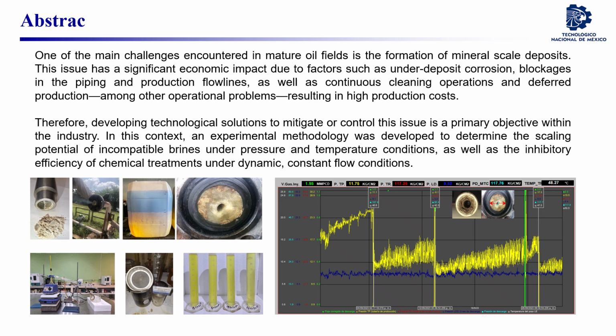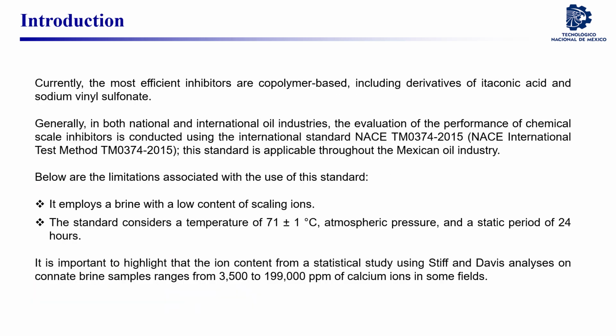For this reason, an experimental methodology was developed that allows determining the scale potential of brine under dynamic conditions of pressure and temperature, as well as the inhibitor efficiency of chemical products. The most efficient inhibitors are based on copolymers, particularly derivatives of itaconic acid and sodium vinyl sulfonate.